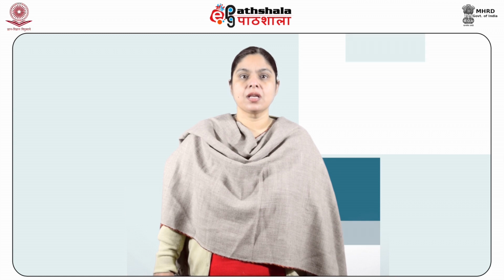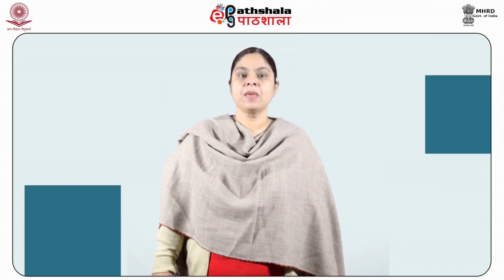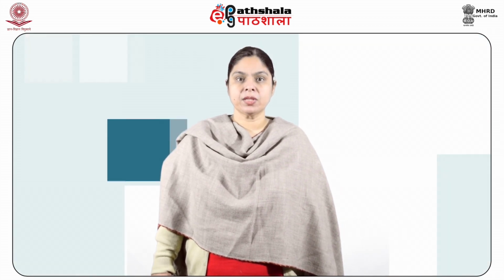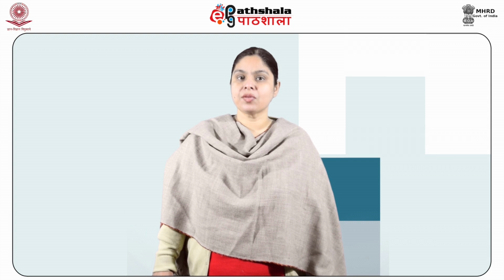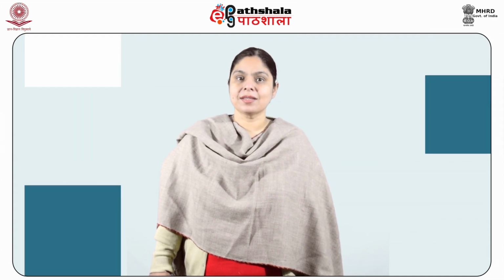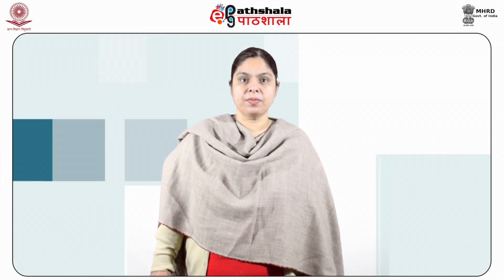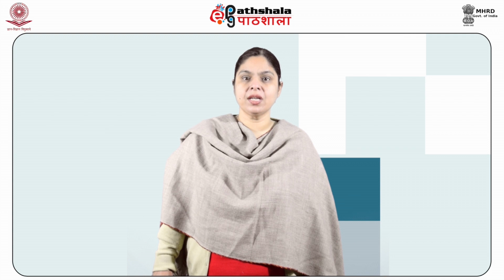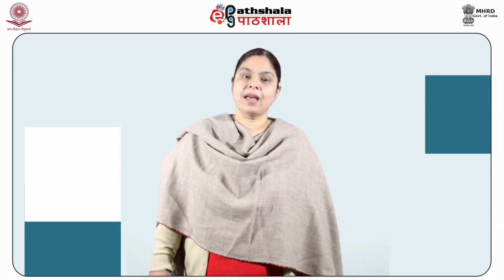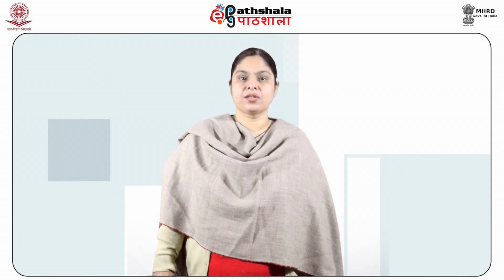Then the analysis is done, taking into consideration that the method we adopt should be non-destructive and should require very little sample preparation. These techniques include pyrolysis gas chromatography, scanning electron microscopy, and X-ray analysis, that is X-ray fluorescence and X-ray diffraction.